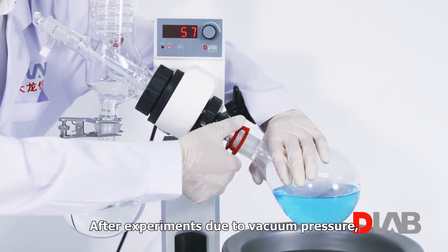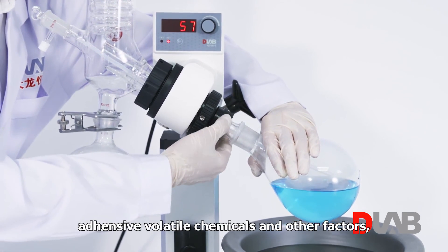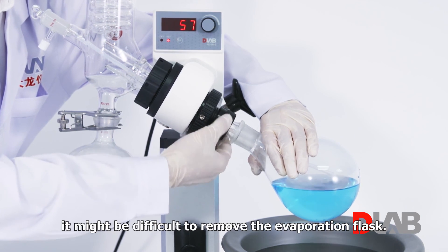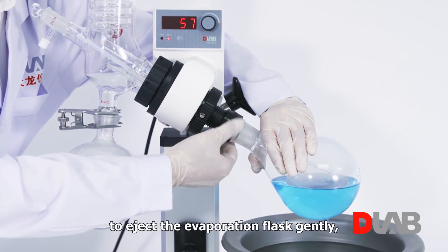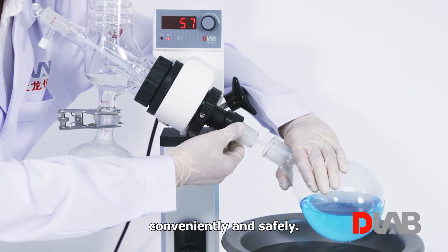Ejection mechanism: after experiments, due to vacuum pressure, adhesive volatile chemicals, and other factors, it might be difficult to remove the evaporation flask. Rotate the ejection mechanism counter-clockwise with the help of the threading to eject the evaporation flask gently, conveniently, and safely.